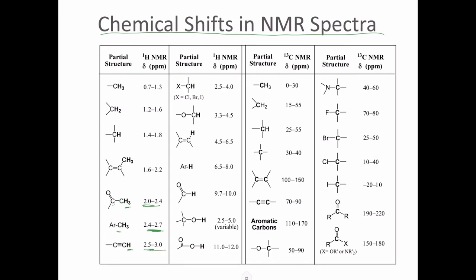For carbon NMR, you need to be able to identify the single bonds and the triple bonds appear below 100. From 100 to 150 is where we have mostly the aromatic compounds and the alkenes. And then the carbonyl functional groups will appear usually at around 180 onwards.